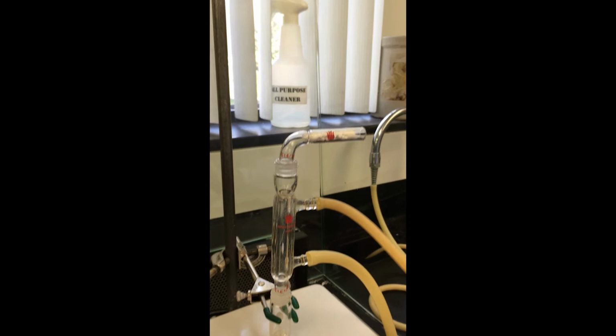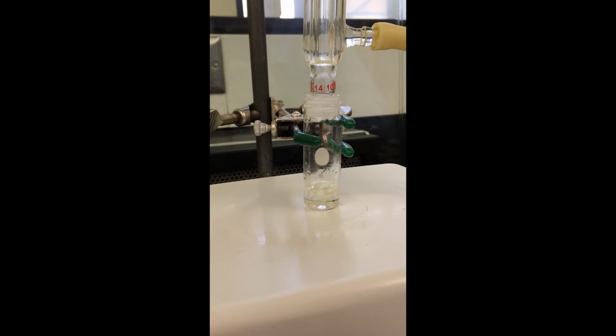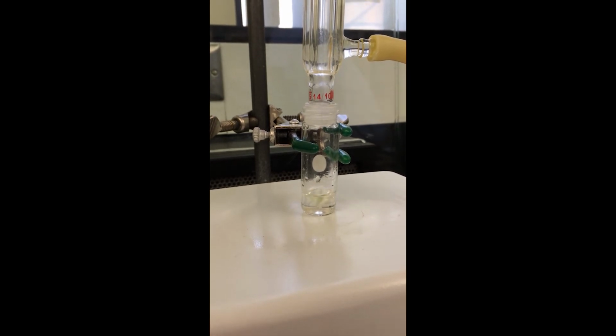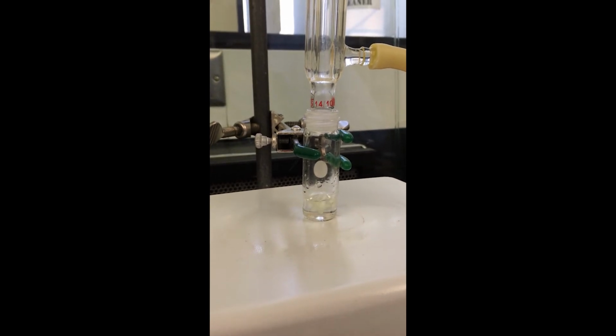Now you'll notice if you look down here at the bottom that all of the crystals have dissolved and that it's actually starting to change color slightly. We've got a little bit of a yellow color in there. That indicates the reaction's proceeding. We're going to continue to heat it up until the solvent is gently boiling, and then we're going to let the reaction run for about an hour.